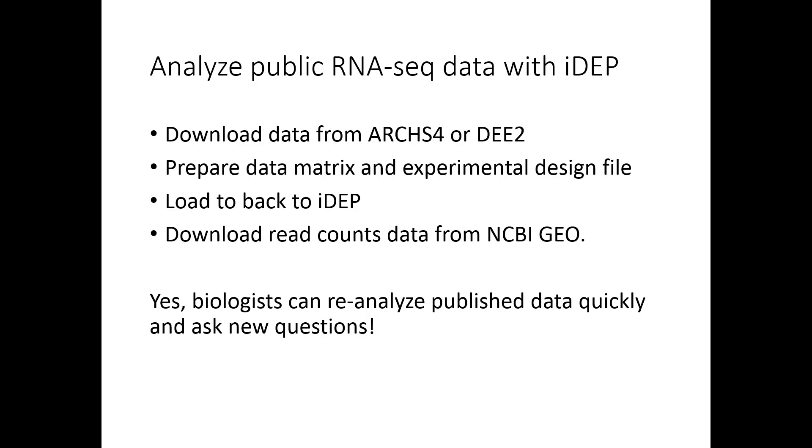So first we're going to download pre-processed, uniformly processed read counts data from ARCHS4 and DEE2, and then prepare this data matrix file and also create experimental design file which will be loaded back into iDEP.